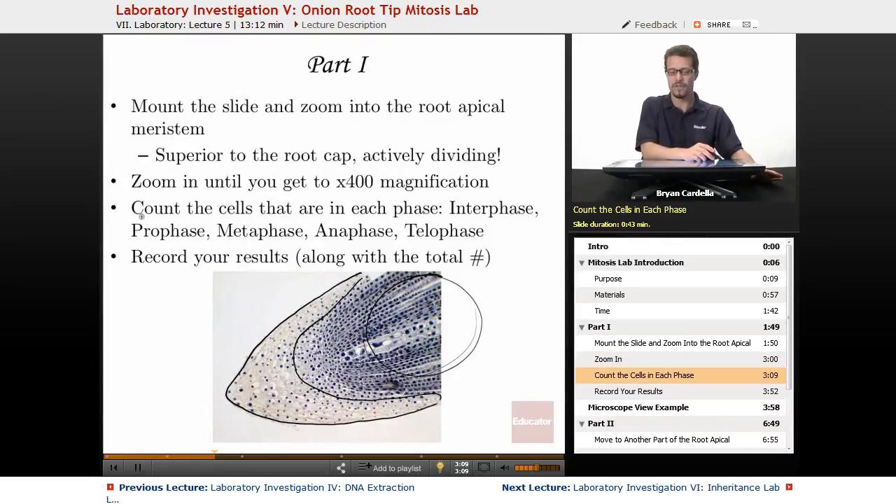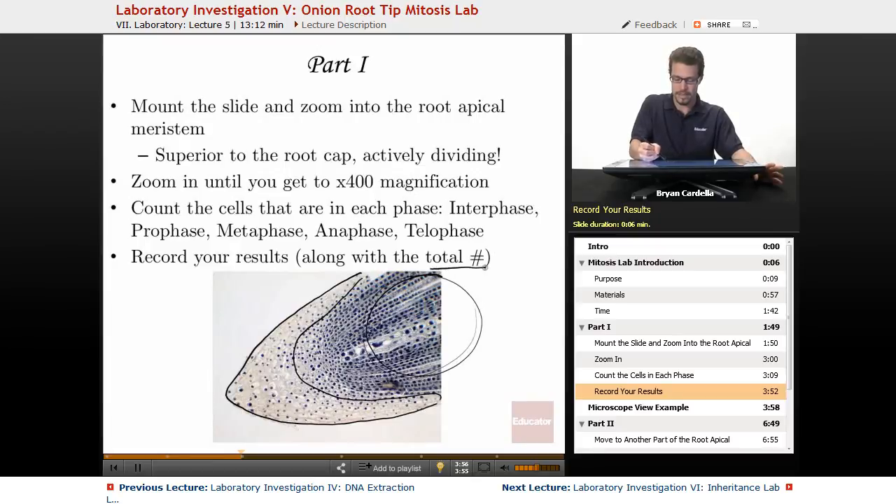Count the cells in each phase. Interphase cells look like plain cells — they have a solid nucleus with a visible nucleolus, between mitotic divisions, so no visible chromosomes. Prophase is when you have visible condensed chromosomes, still bundled together in the nuclear area. Metaphase is when they're lined up along the equator — the metaphase plate. Anaphase is where they're being pulled apart. And telophase is where groups of chromosomes are toward the poles of the cell, about to be bundled into new nuclei. Record your results along with the total number of cells counted.